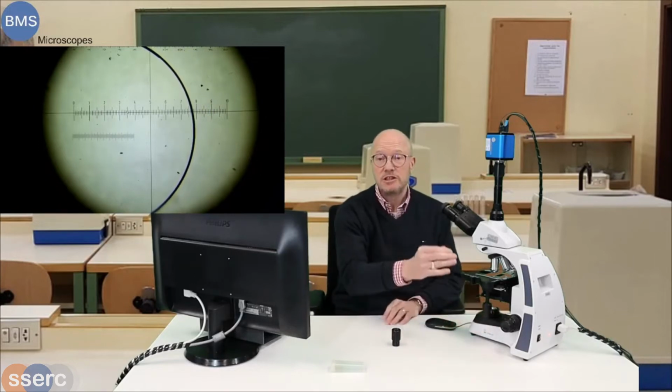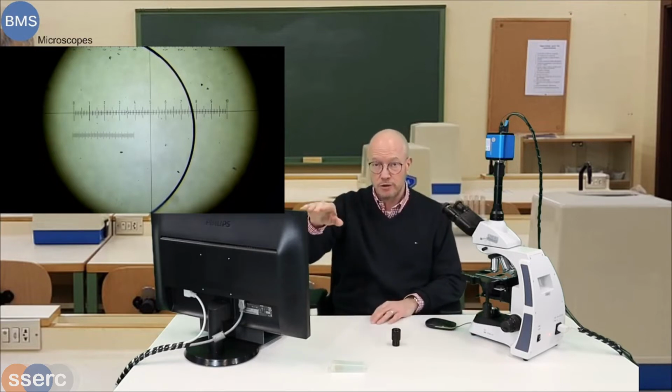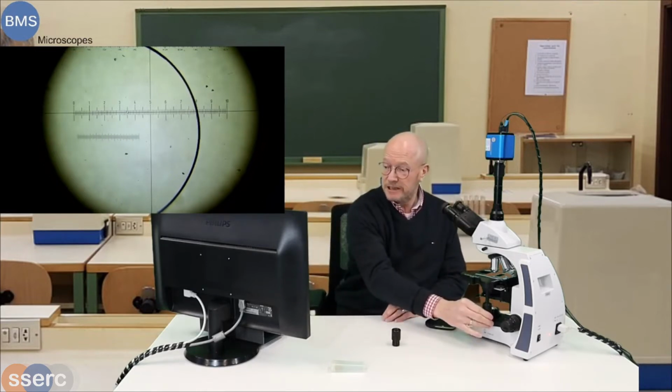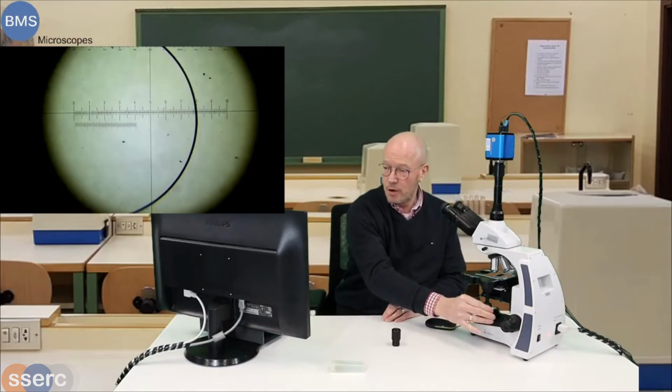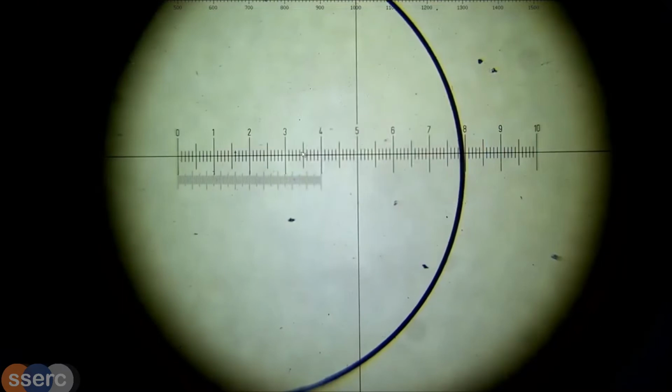I've put the graticule inside the eyepiece on a horizontal level, which makes it easier for me to line both rulers up just like that. You have to find the best overlapping moment.